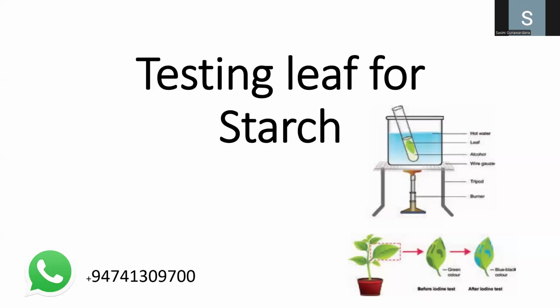To confirm whether photosynthesis has occurred, scientists perform a simple experiment to test the presence of starch in a leaf. The iodine test or the starch test is commonly used for this purpose. When iodine solution is added to a leaf, it changes color to blue-black. This experiment helps us to understand how plants make and store food and provides evidence for the process of photosynthesis.